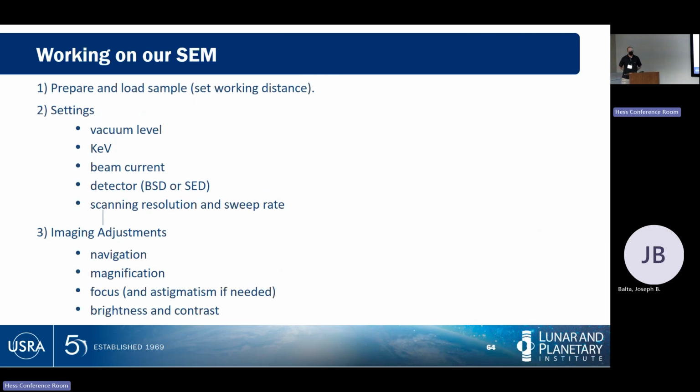All right. So, as an overview here, when you get on our SEM this afternoon, the things you're going to need to do, in order.